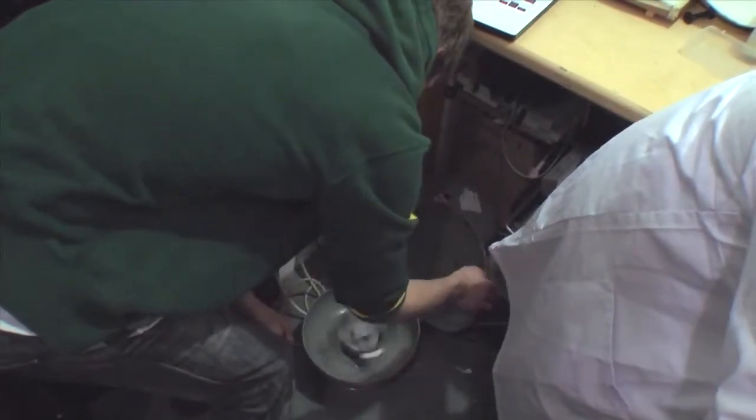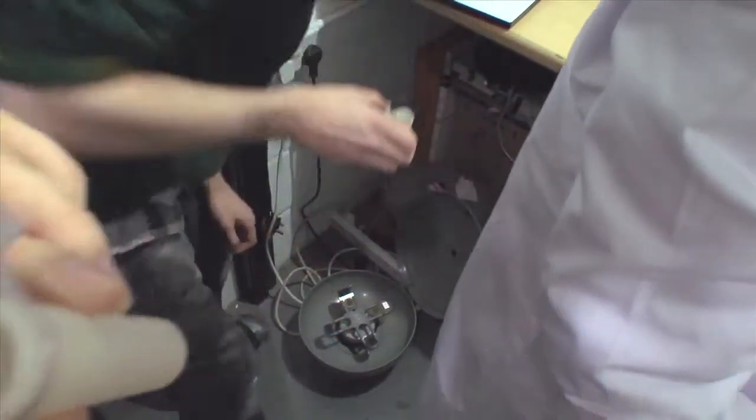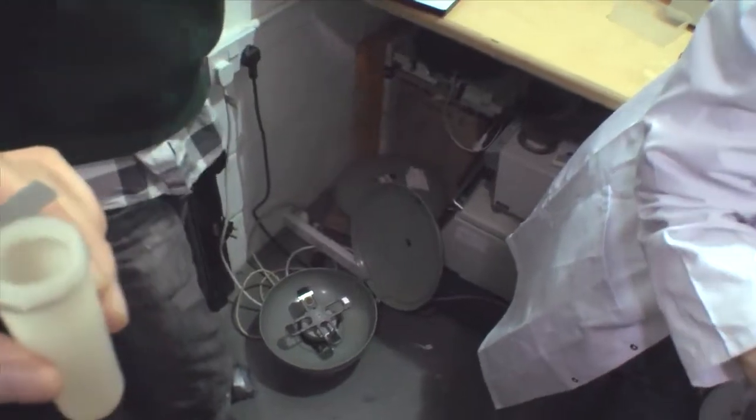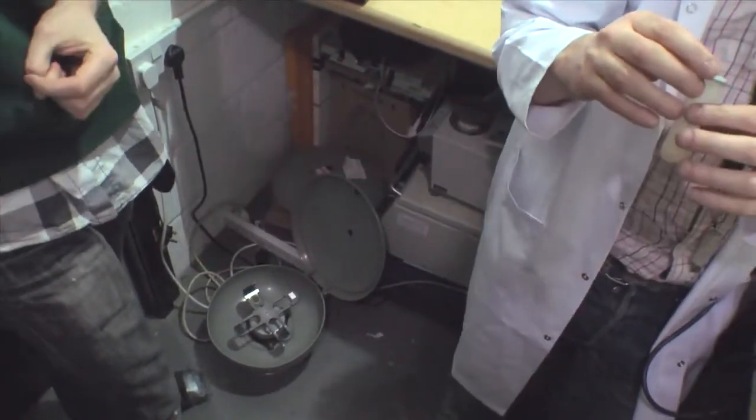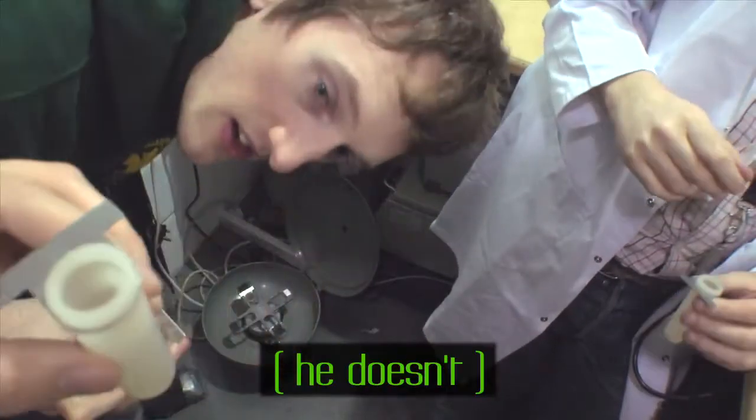Right, that's five minutes, so we'll stop it. Simon, have a look if you've got a pellet. I've got a pellet. I don't think you'll be able to see it. You got one? I think I do, yeah. But can we try?